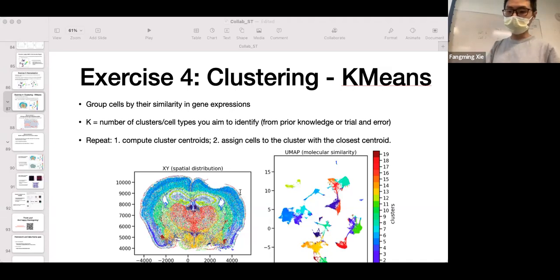So here, for every cell, you have their gene expression, but we want to add a new column to it called cluster label, or cluster, which we know already. We know its result. Just assign it here. So it becomes a larger matrix where the last column is the cluster label for each cell. Then there's a powerful command called group by in data manipulation. Group by means literally group everything by something. So we want to group this data matrix by the last column, by the cluster label of each cell.